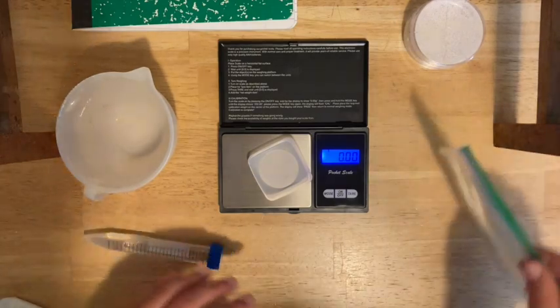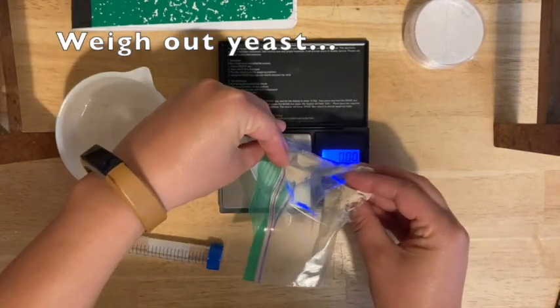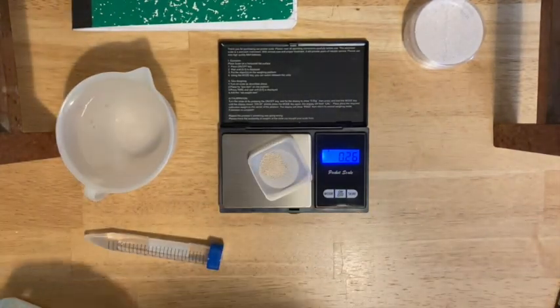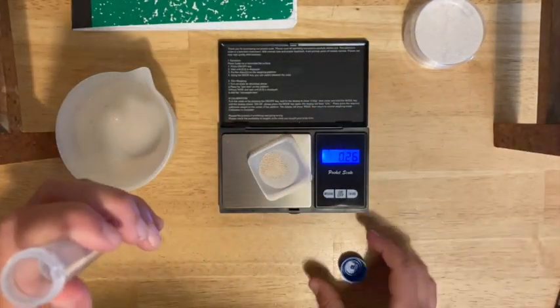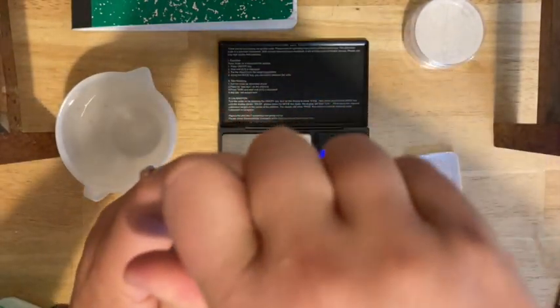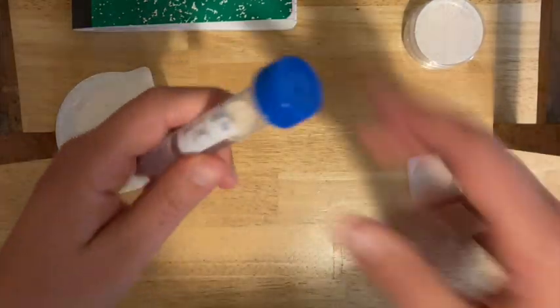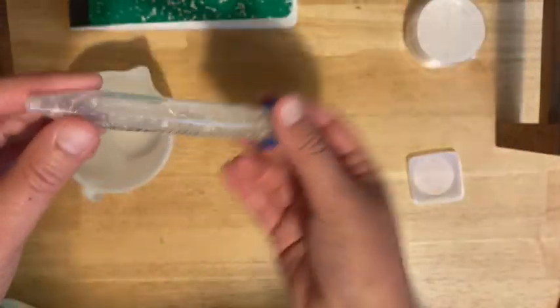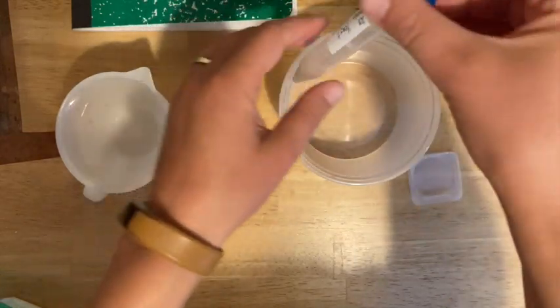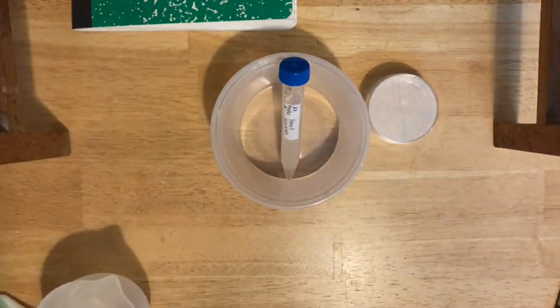Now add the yeast. Make sure the balance is at zero and weigh out the right amount of yeast, then add it into your tube. Secure the cap firmly and invert to mix the yeast in. Let it sit and start to grow and divide. Place it upright with the cap a little bit loose so it can vent — it's going to create carbon dioxide gas. Leave these two things to sit and clean up everything else.